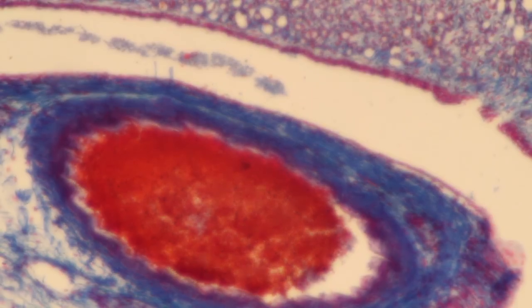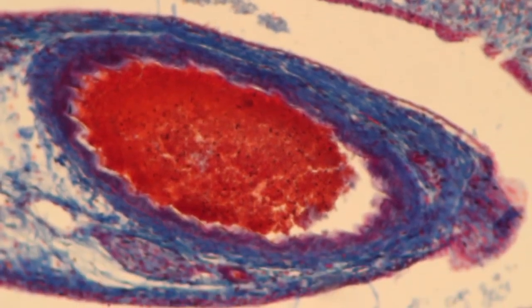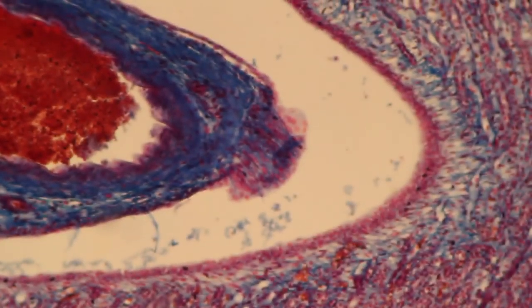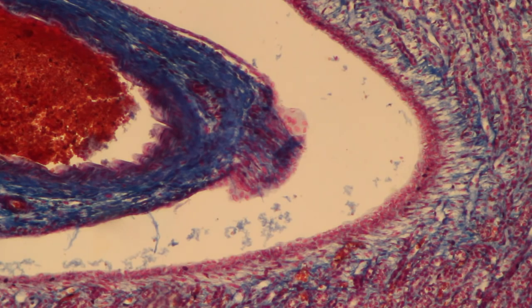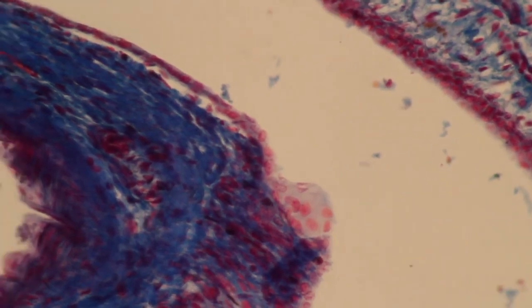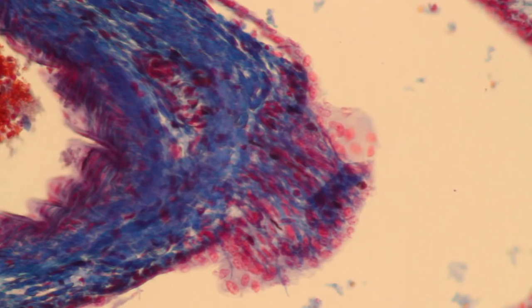The 10x objective is now in place. You notice that the image is now again slightly out of focus. I only use the fine focus knob to focus the image. I center the place I would like to observe, refocus a little bit, and rotate the next objective into position. It is again slightly out of focus, so I use the fine focus knob only to focus the image and re-center.